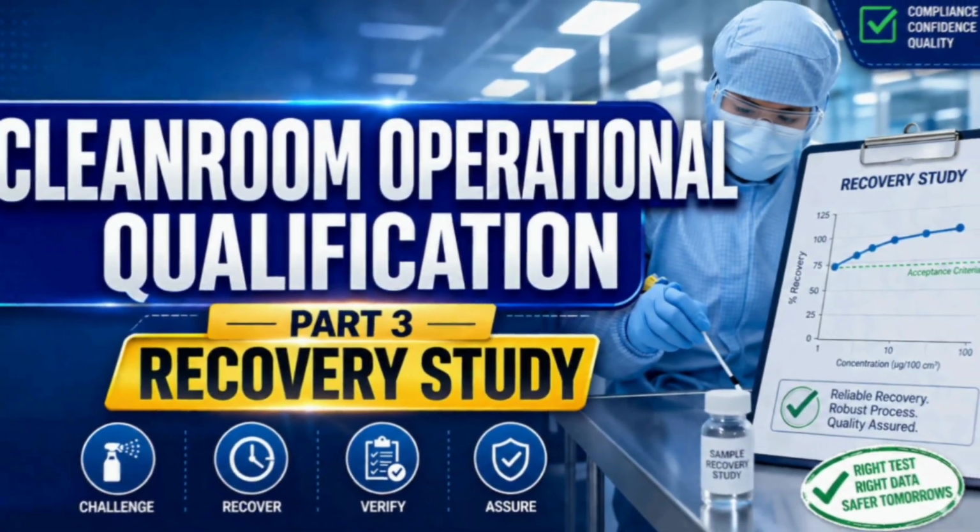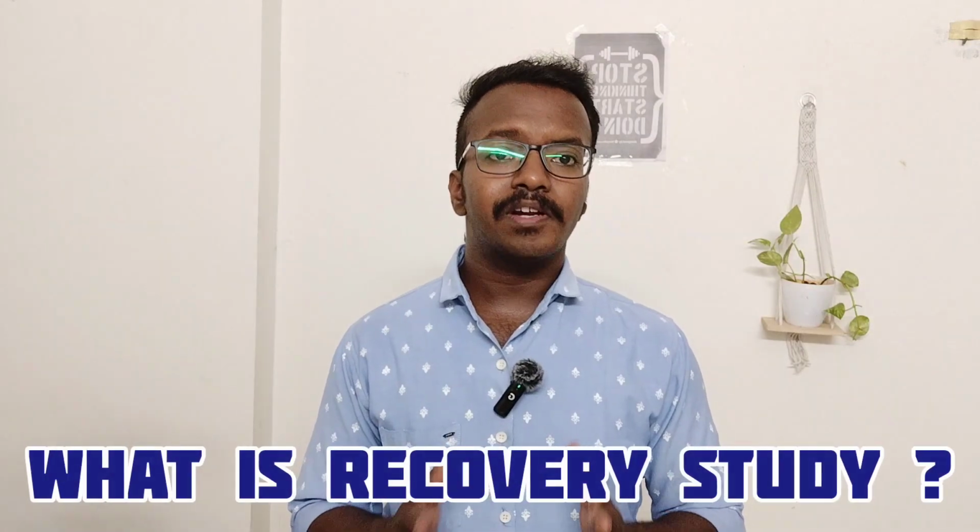Hi friends, this is a series of Cleanroom Operational Qualification, Part 3: Recovery Study. What is the meaning of recovery study?